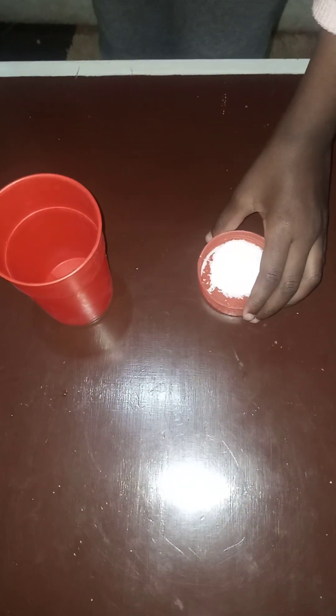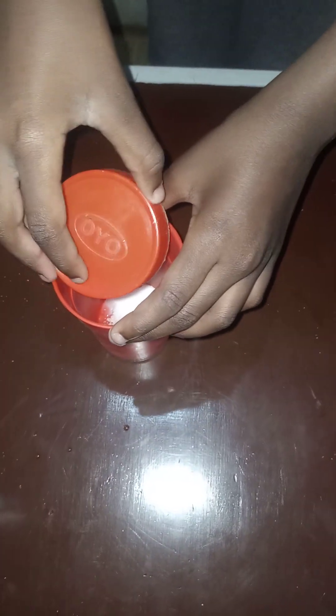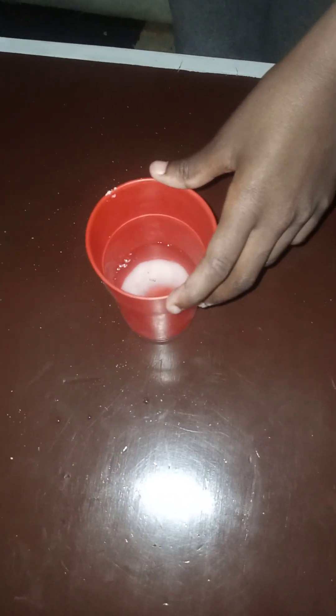Now we are going to mix the salt with water to make a salt water solution. We are going to add water into that particular salt we have put into this plastic jar. We will stir the solution to the point where a good percentage of the salt has dissolved. We are stirring it up to ensure the solid part of the salt is completely dissolved into the solution. We now have a concentrated salt water solution.